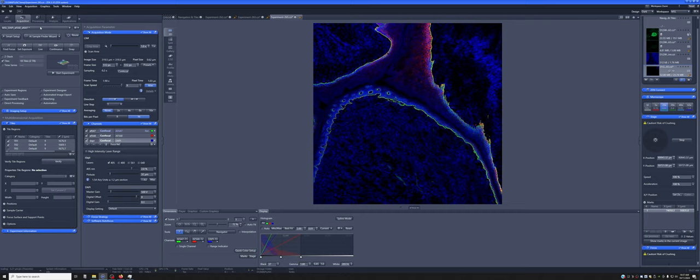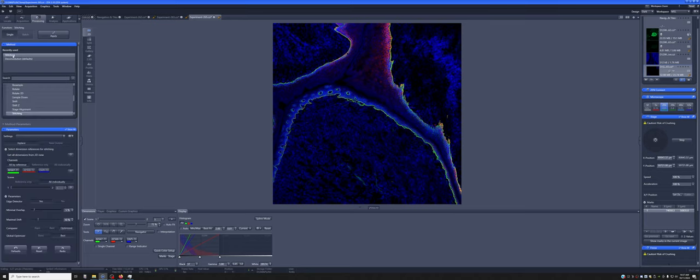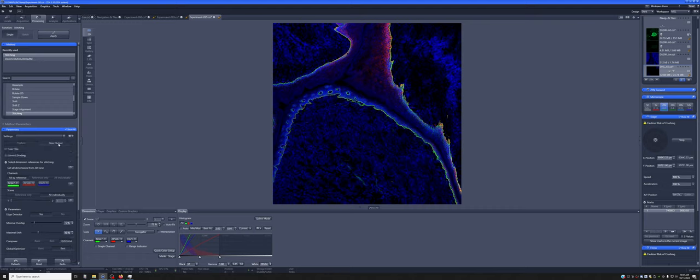The way to do it is we go to processing. We use the stitching. And if it's not here in the recently used list, you can just search for it. In stitching, we're going to create a new image. So we have to tell it to use a new output. We want to fuse the tiles together.